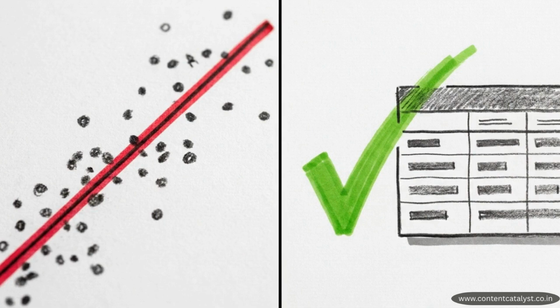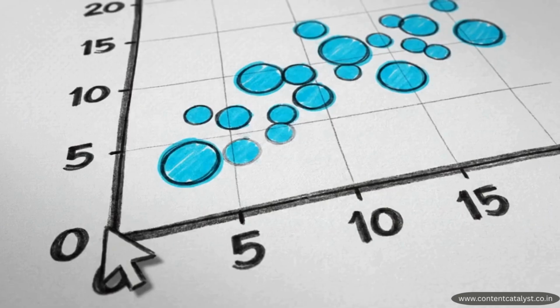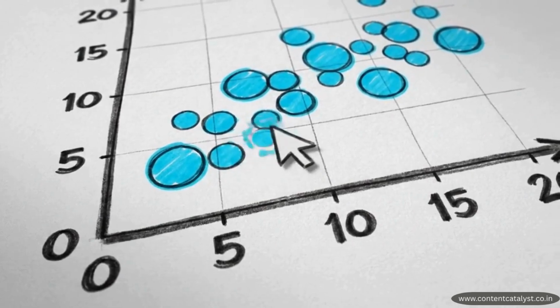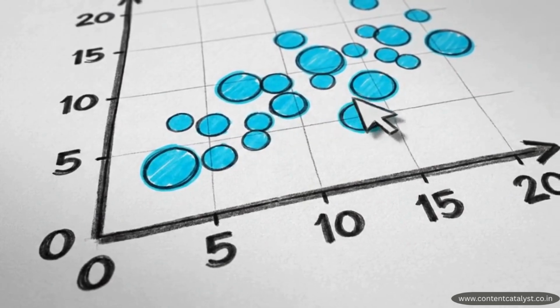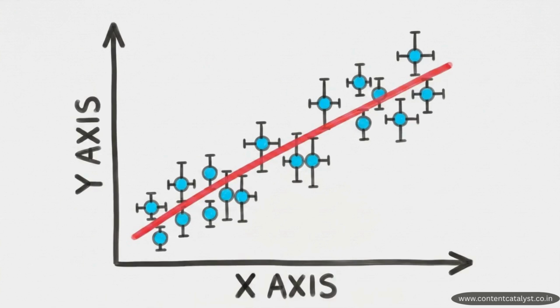Pairing the visual trend line with these concrete statistical outputs provides the evidence required to evaluate your experimental hypothesis. At this stage, the default graph works for your own analysis, but it does not meet the strict aesthetic requirements for peer-reviewed publication. Double-clicking the axes or data points opens customization menus. Here, you can add bold axis titles, increase font sizes for readability, and adjust colors. Crucially, this is where you attach error bars to your data points. This is a strict requirement for communicating scientific accuracy in any journal. These targeted formatting adjustments ensure the visualization meets the specific legibility and style requirements of academic journals.